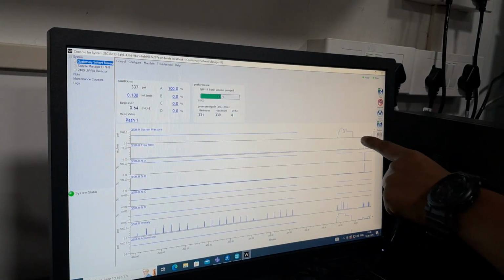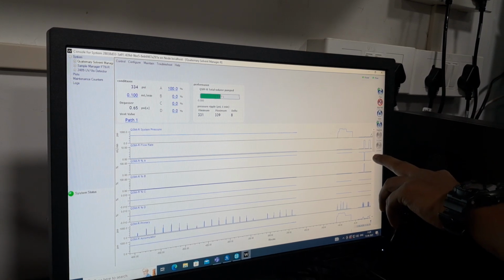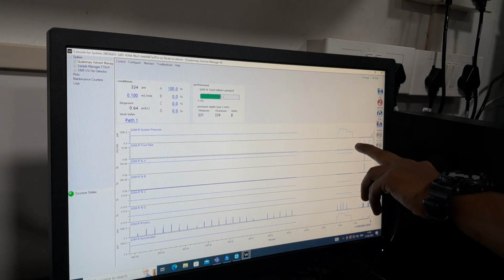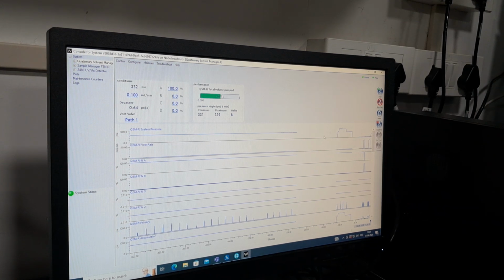When I came here, after that I started the priming. I started the priming, I started the flow. So now the flow is going up, and it will give the pressure actually. I'll just keep the cursor here. It is now 11 something. This is around 9:30 or something. Okay, yes, 9:49. So at that time nothing was there.